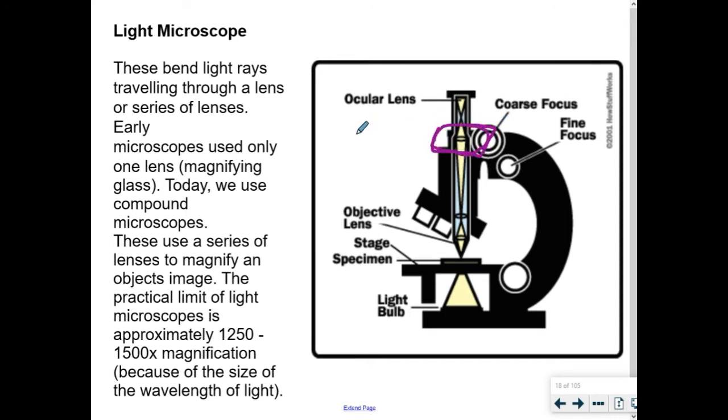There's one lens right here, and then there's a second lens right here. And what these lenses do is they bend light. Okay? It's really no different than what your glasses do, if any of you wear glasses or contacts. It refracts the light, it bends it, and if you know enough about the principles of optics, it's like a magnifying glass. You can make something bigger.